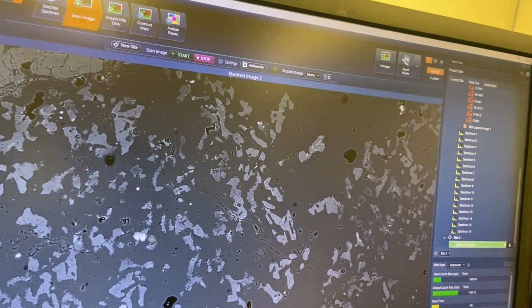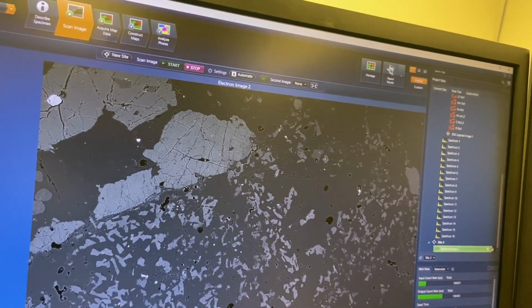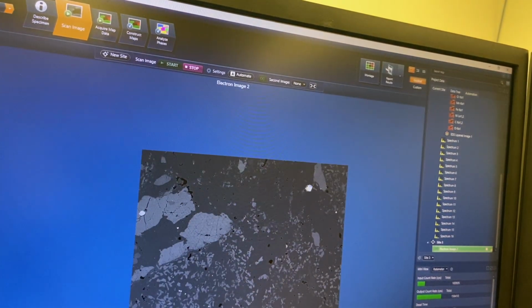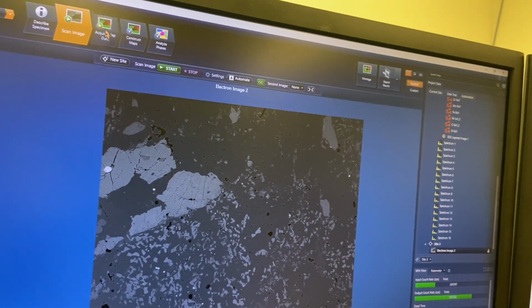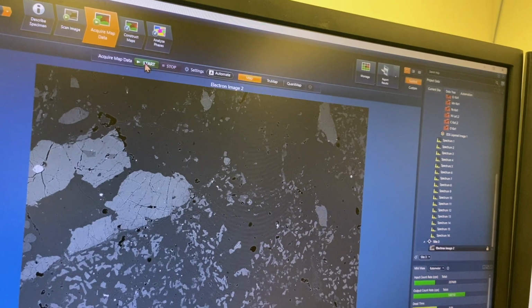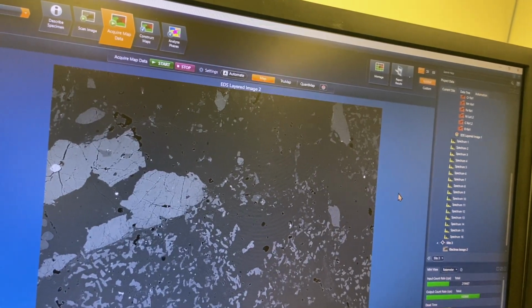And then we have this feathery texture. Maybe it's not a troctolite melt breccia, because it seems like maybe there's a little more than 10% pyroxene. I don't know. I'd have to check. Let's see. Let's do another map. All right, just let that go for a bit.